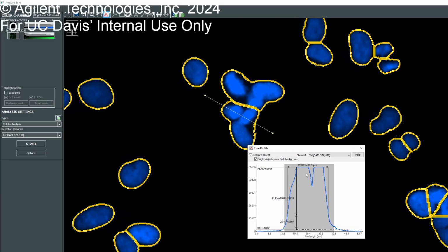And now we can see that this is the peak. So the intensity is already peaking out. We did a little bad job in terms of setting up the auto exposing part, so now this is completely exposed. But you can also see the 25% number between the background and the signal. This is the peak intensity of the signal profile of these 2 cells. This is the background noise, which is 1800, and the 25% number is something you can use for threshold to separate between the background and the signal.